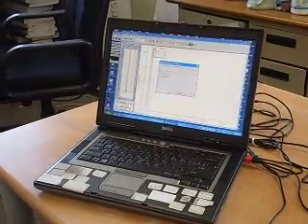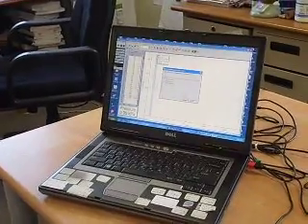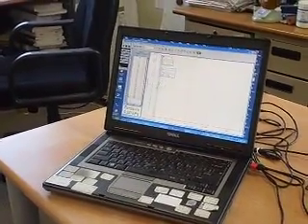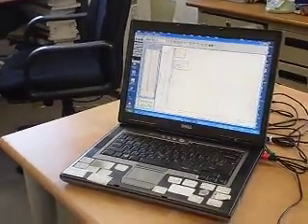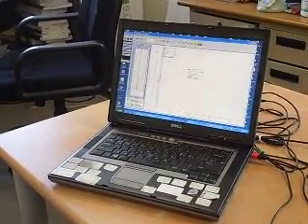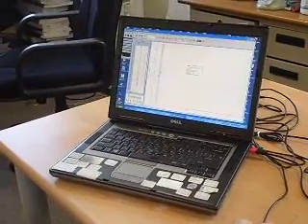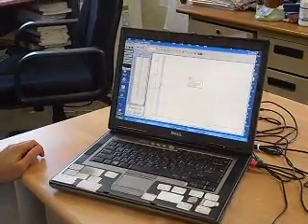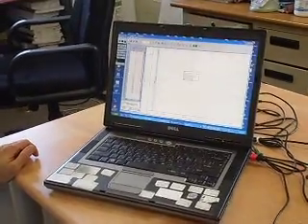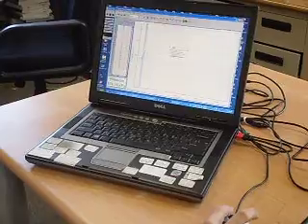So I'm going to check on run 1, which is my first run down here. I click on OK. This will be for my first one. So the steepness or the slope is 0.69 or 0.7. So that is the steepness for the first 20 seconds.